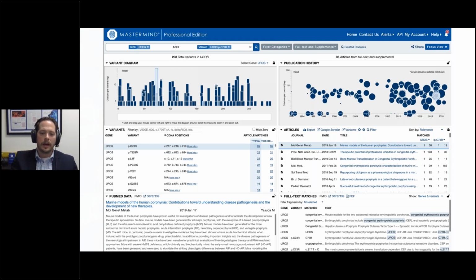And then on the left, we have the full variant landscape to allow you to put your interpretation for that single variant in context. In this case, I'm showing the single gene's variant landscape, but as I emphasized before, you're at liberty to add multiple genes, multiple variants, and review the information in the fullest context of that patient case.